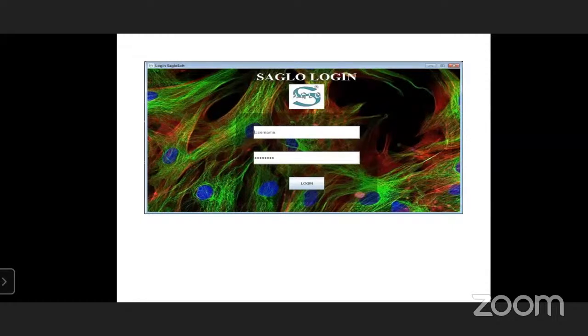दुसरं म्हणजे त्याचं रिपोर्टिंग व्हायला पाहिजे. Means you can generate the report by using this software, validation व्हायला पाहिजे and authentication असलं पाहिजे. What is authentication? जे काही रिपोर्ट होते त्या रिपोर्टवरती by using software one can put their name as a developer or as a chemist, as a director, whatever the name आहे ते नेम त्याच्यामध्ये यायला पाहिजे.